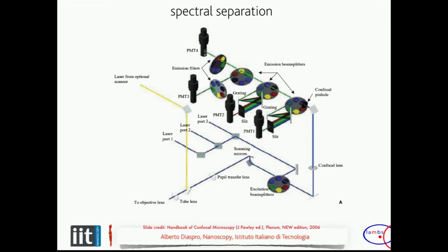You have a chain. So usually what happens is that you receive light, different wavelengths, then you start selecting one, and then other components are passing to another element, and so on, and you are losing light every time, more and more light, for the spectral window you are interested in, because at every step you are not gaining photons, you are losing photons. I will give you a number later.